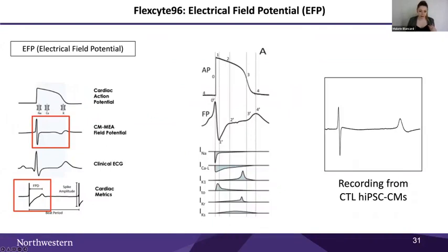So here's the action potential with all the different phases and its correspondence with the involvement of sodium and then calcium, and when it's happening and all of that. And this is an actual recording from our cells, to show you that we were definitely able to see it. And if you remember the EKG, as I was talking before, it definitely looks like we are doing an EKG on our cells. So that's kind of what you can do with the machine.